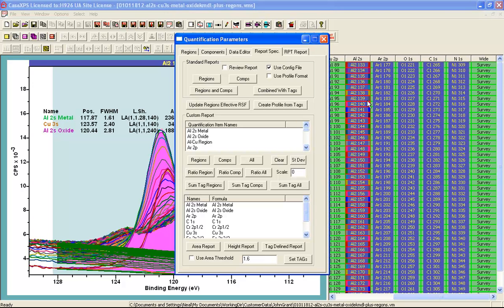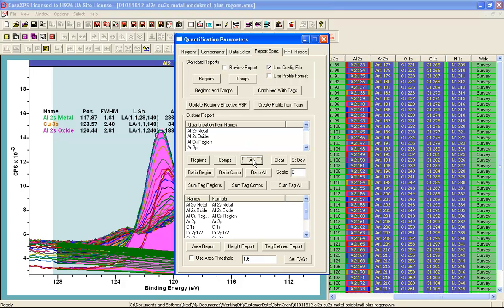I now have all the VAMAS blocks selected that are needed for the depth profile and I can create a list here representing the regions and components by clicking the all button.